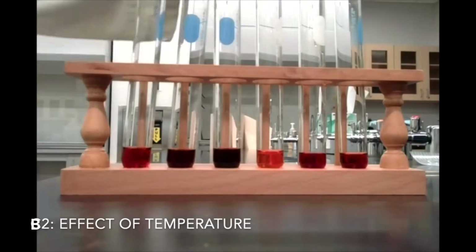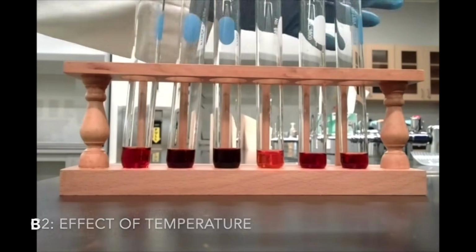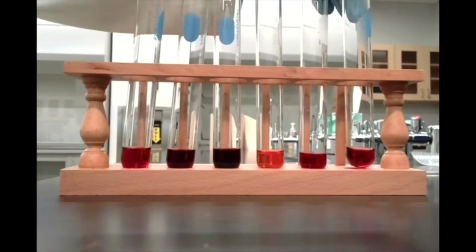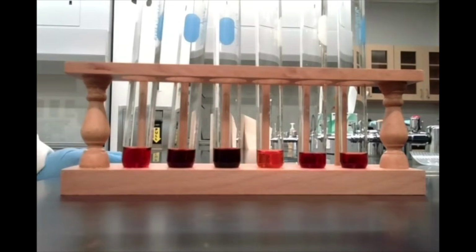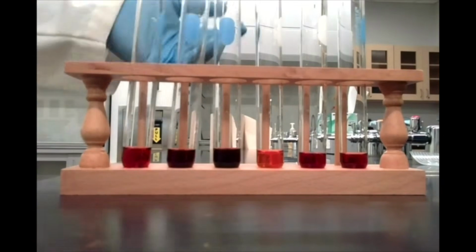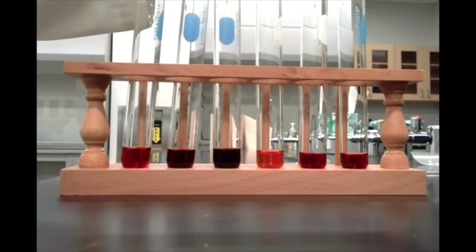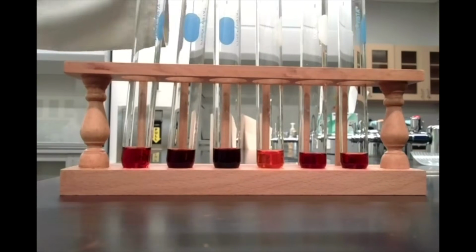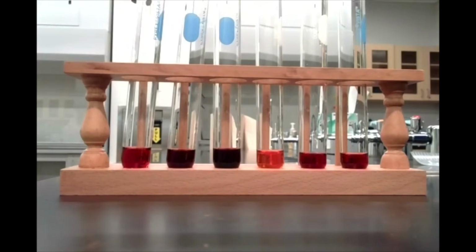All right, for the last part of this section and the lab in general, we're going to take test tubes 5 and 6. We're going to put them into an ice water bath and a hot water bath, respectively, and see how that affects our equilibrium. Accordingly, you'll see that one of these will shift towards the reactant side, the other shifts to the product side. You should be able to tell pretty easily based on the color change, right? And describe that accordingly to explain why. You can tell one's the reactant and one's the product.